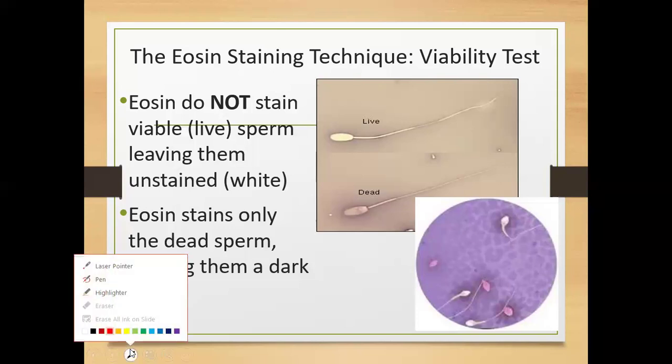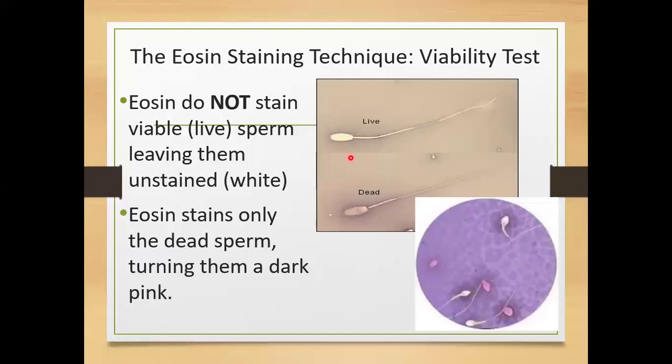This is how you're seeing. So this one is colorless. So of course it is what? Live. This one has that pinkish stain, so it is dead. If you look at those ones here, this is very classical. So this one, what can you describe this one? Dead or alive? This sperm here, is it dead or alive? It's alive. Alive. Good. What about this one? Dead. Dead. Good. That's all. So you got it.